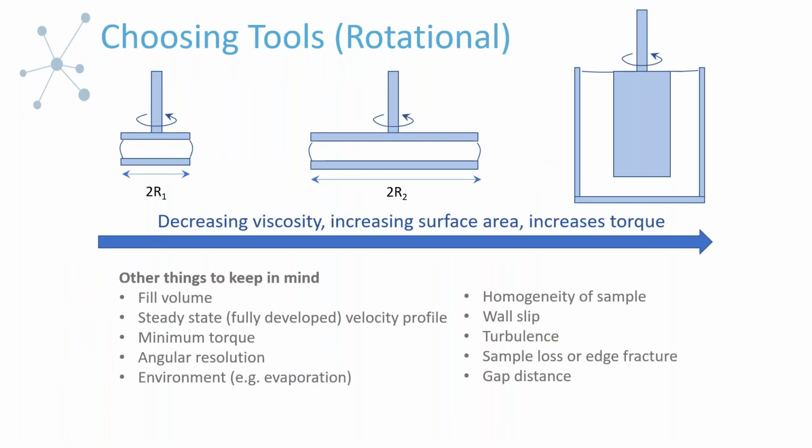Okay, so I want to start, since some of the questions that came in with the submissions and signups for the webinar were directly related to our topic today, so I wanted to fit some of those in there. One of these was on how you make the decision on what tools to choose depending on your sample. So I can make a quick comment when it comes to choosing flow channels for our instrumentation.